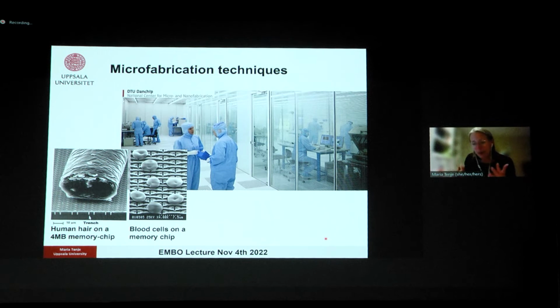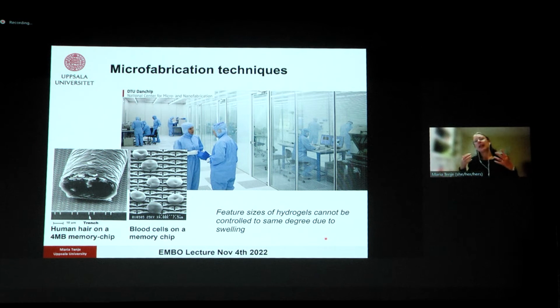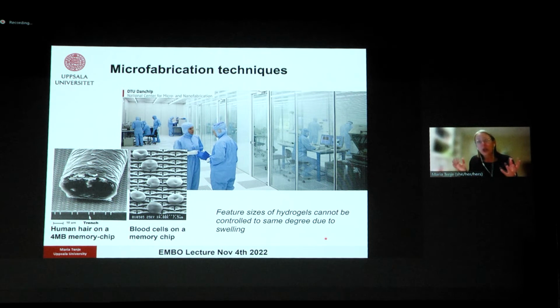But what you need to remember is that even if the fabrication techniques that we use have resolution on the sub-micrometer scale, hydrogels can normally not be fabricated to that degree of resolution, because they will swell and they will interact, because they have all this water inside the polymer matrix. It will change a lot in the dimensions. So normally we are operating on them at a couple of tens of micrometers, maybe 50 micrometers and upwards.